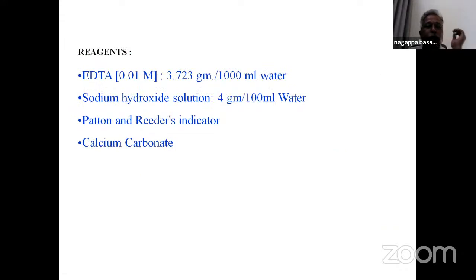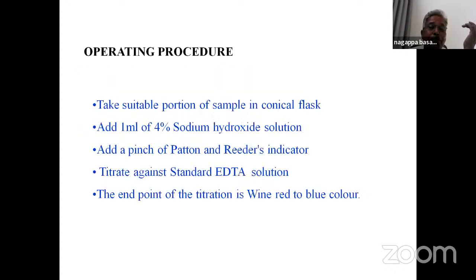EDTA, 0.01 molar, and sodium hydroxide reagent are required, along with Patton and Reeder indicator for calcium. As a calcium standard, we are using NIST calcium carbonate.